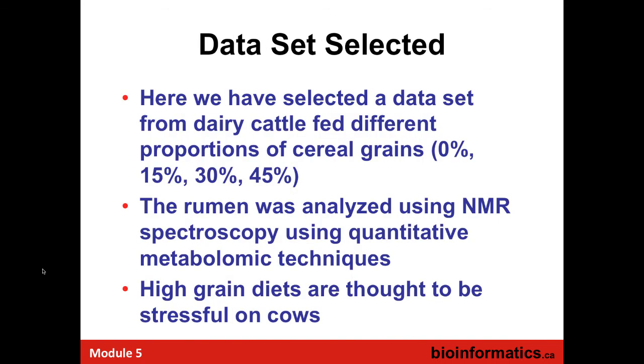The data that I'm using in this example is from dairy cattle that were fed different proportions of cereal grains, basically barley. And in Canada, and actually the US as well, most cattle are fed grain to supplement their diet.